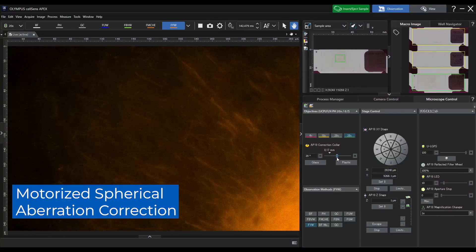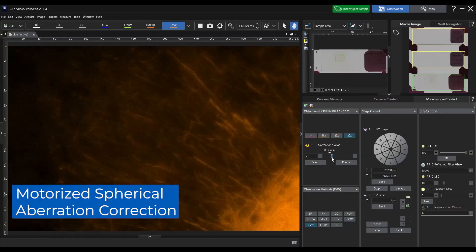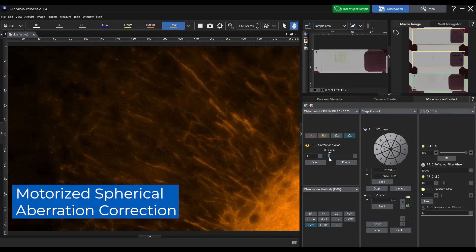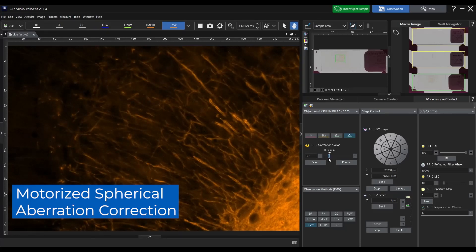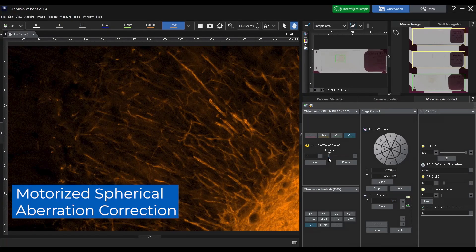To correct for spherical aberration, the microscope's motorized spherical aberration correction is easy to use and brings out the true optical performance of your objectives.